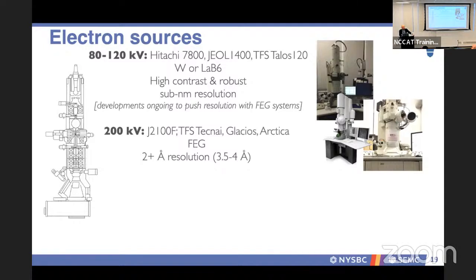So 200 keV is something that we've been using during the short course, and that's usually reserved for somewhere intermediate. It used to be reserved for what we considered screening microscopes, but more and more it's being used for data collection microscopes because it's in that moderate range where you would have good efficiency, and our detectors work pretty well in that keV range.